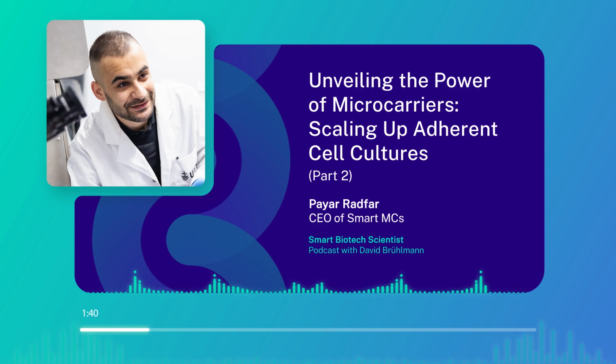In fact, the way we work with our clients is similar as well. We start very small scale, extremely small. We're talking about 3 ml well plates. You test different types of carriers because they play a huge role, and that's part of the customizability that we offer. So we screen for different carrier properties and make sure that we understand what each cell likes. It can start with static culture in a simple well plate. You can start agitating it by simply shaking the well plate and see the effect of that agitation over time. Then slowly work your way up.